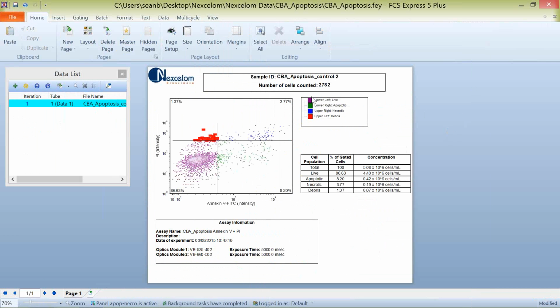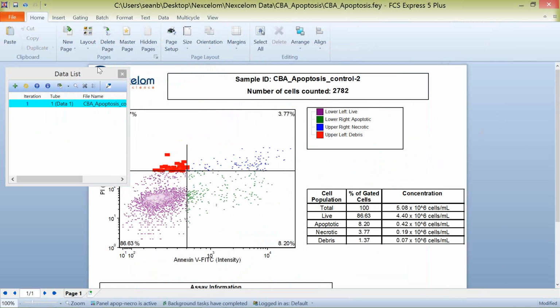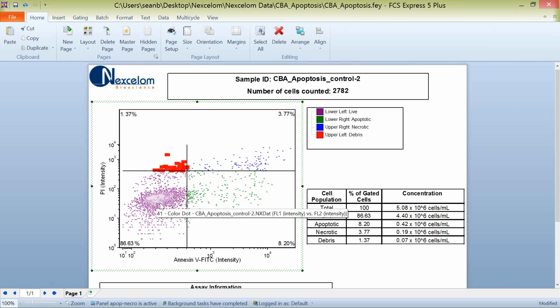So you can see with the apoptosis template and this plot that we have in here, immediately two things pop out. One is we've enabled a feature in FCS Express 5 called density shading, or shade based on density. You can see that here in this purple population, we're actually starting to highlight the density of the population within the plot in the same color as the backgating there.